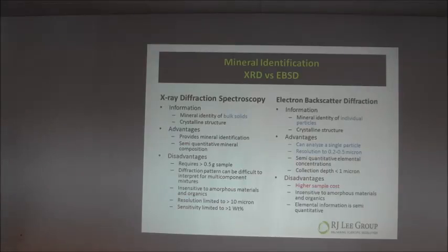You can get some quantitative information, more semi-quantitative. You can tell if there's a little bit, a lot, or a trace amount there. But it's not a real quantitative technique if you're looking for quantitation. Another technique that's less well known is electron backscatter diffraction.